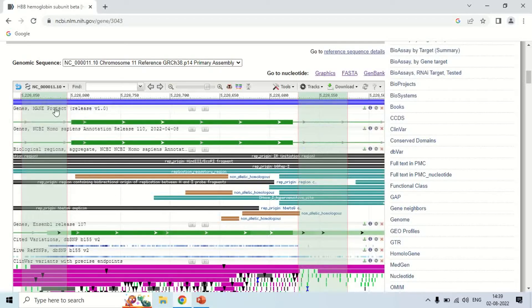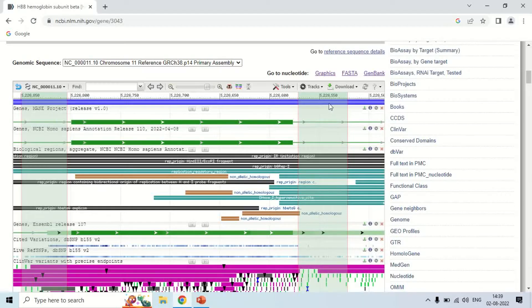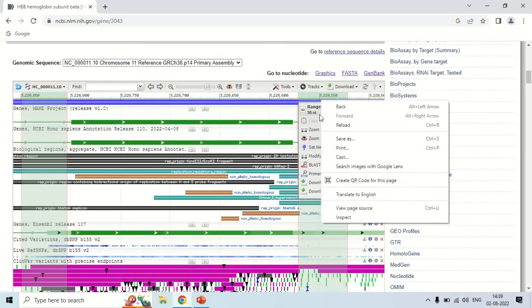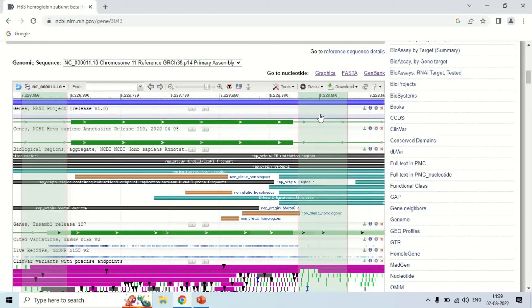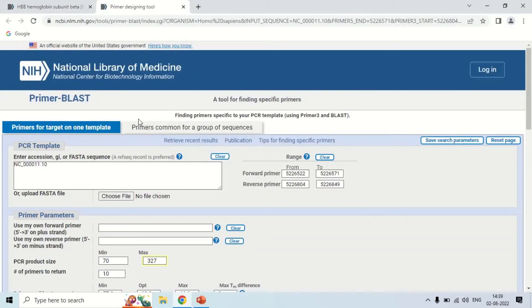Once you have selected the portions for the forward and reverse primers, right-click and you will see the BLAST and primer search options. Choose the 'Primer BLAST selection' option. This will open another window which is the Primer BLAST software of NCBI.